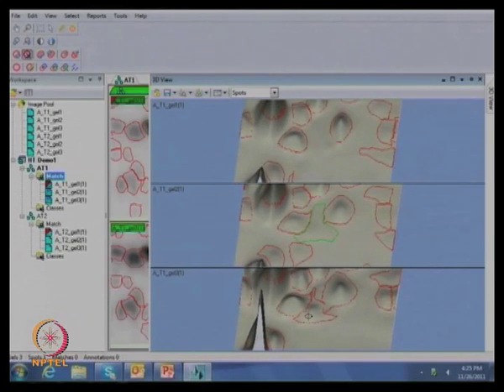I think sometimes it is possible that your treatment may have that spot appearing due to the upregulation of a protein, or it is totally shut down. But it is not the case exactly here, because these are all the 3 replicates of the same protein. So this should be the same, but somewhat it is not there, so we can delete these 2 spots here. Or in this case, I guess it is doubtful, so let it be.